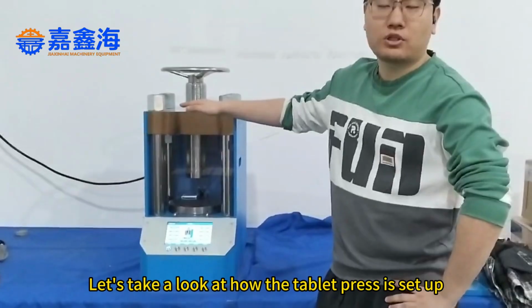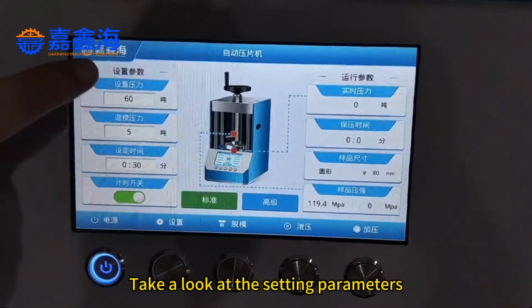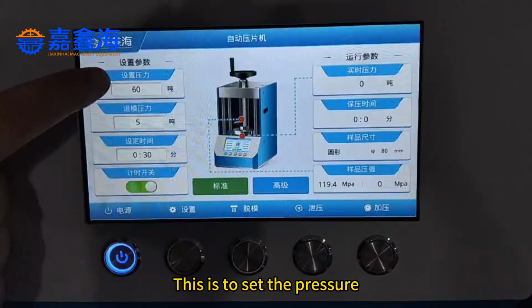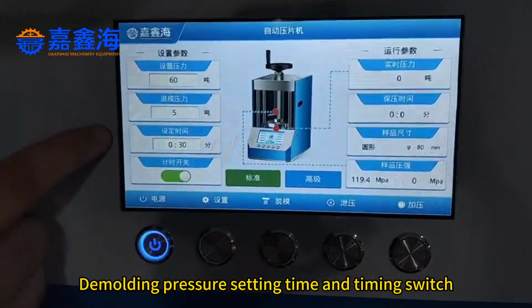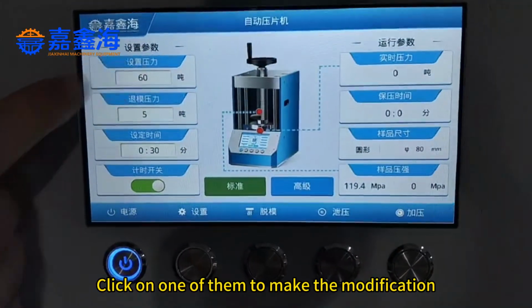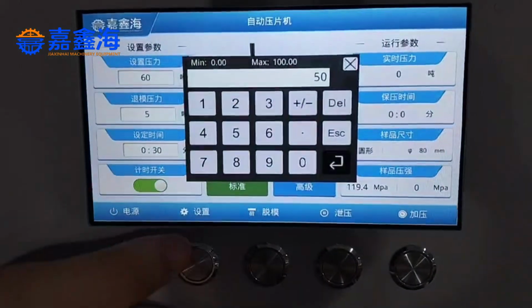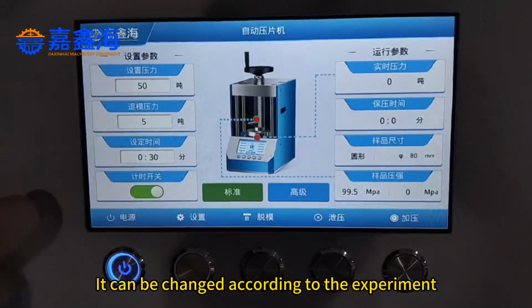Let's take a look at how the tablet press is set up. Take a look at the setting parameters. This is to set the pressure, demolding pressure, setting time and timing switch. Click on one of them to make the modification. It can be changed according to the experiment.